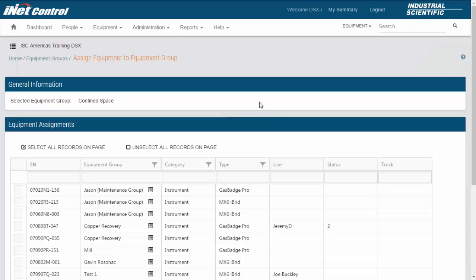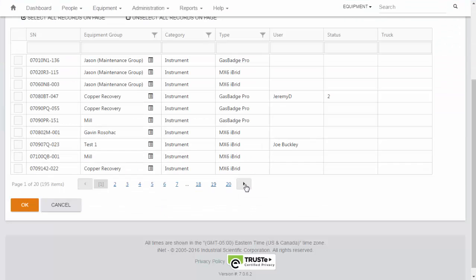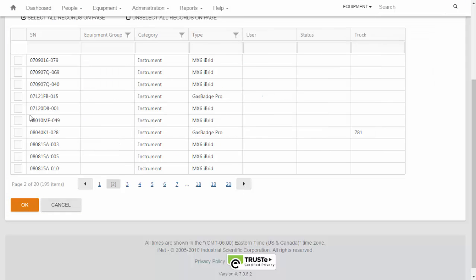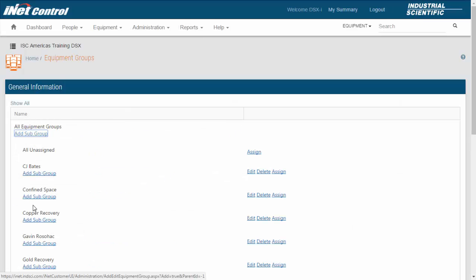It will then bring up all of our listing of equipment. From here, I will be able to find my instruments that I need to add into this group, and add them by clicking on the checkbox next to their serial number. Once I find the ones that I want into this group, I can click OK, and it will add those instruments into this group.